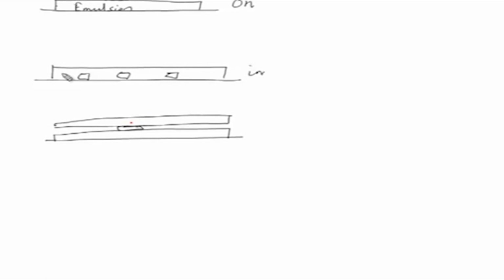Now, if the emitter is under the emulsion, then half the radiation goes in one direction and half the radiation goes towards the emulsion. If it is on the surface, again half will go towards the emulsion, and half or less than 50% will reach the emulsion actually.